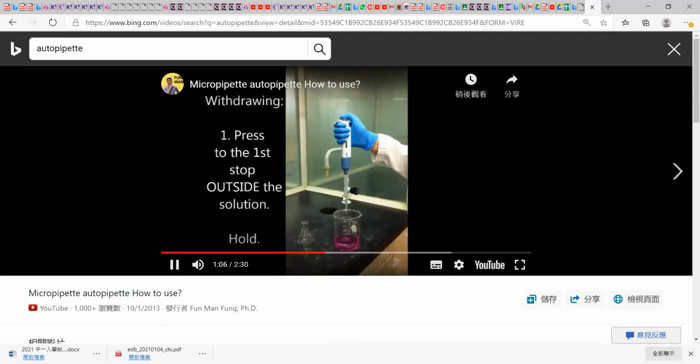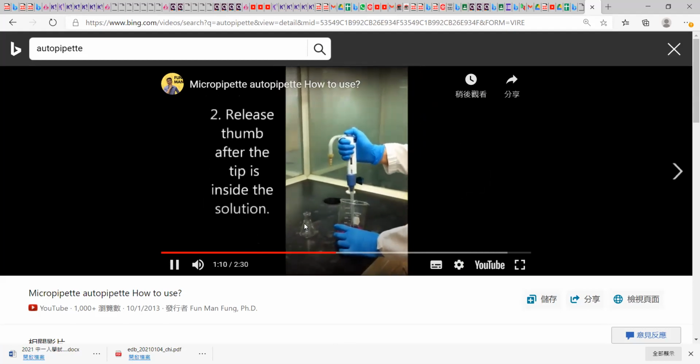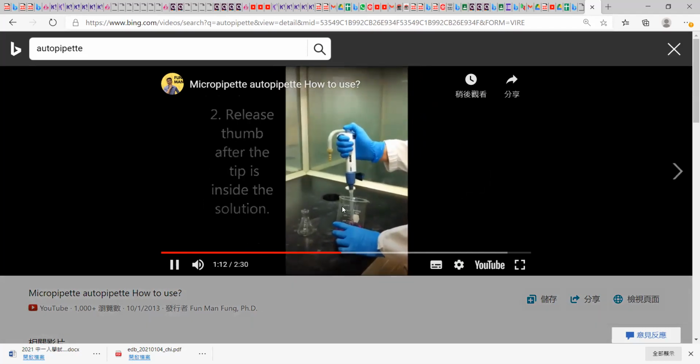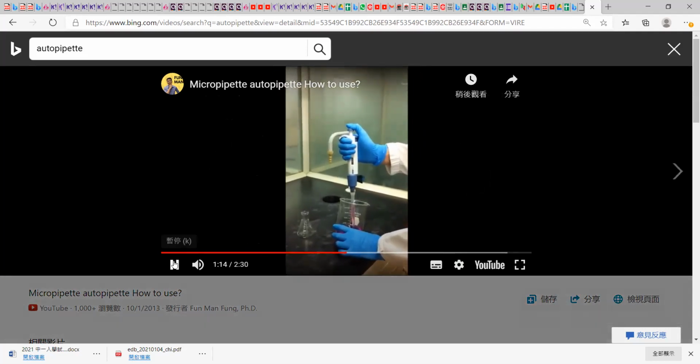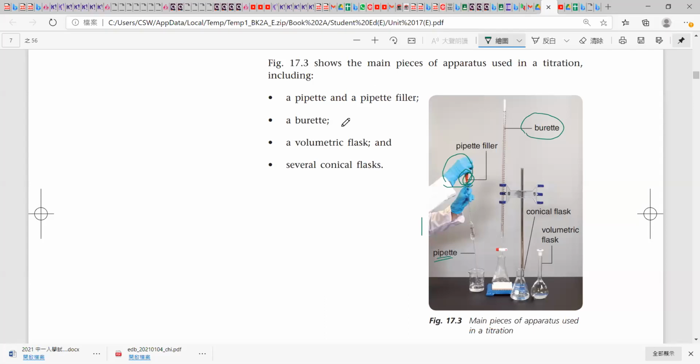you may see some other auto pipette in which we have got 5 or 10 auto pipette sucking up the solution altogether, right? It's done by machine. 咁呢個咧就係 biology 我哋會成日用嘅，即係都幾型喎。咁樣 auto pipette。咁我哋用緊嗰隻咧就係呢隻，傳統係用自己嚟啦 pipette。除咗呢個之外咧 we got conical flask.